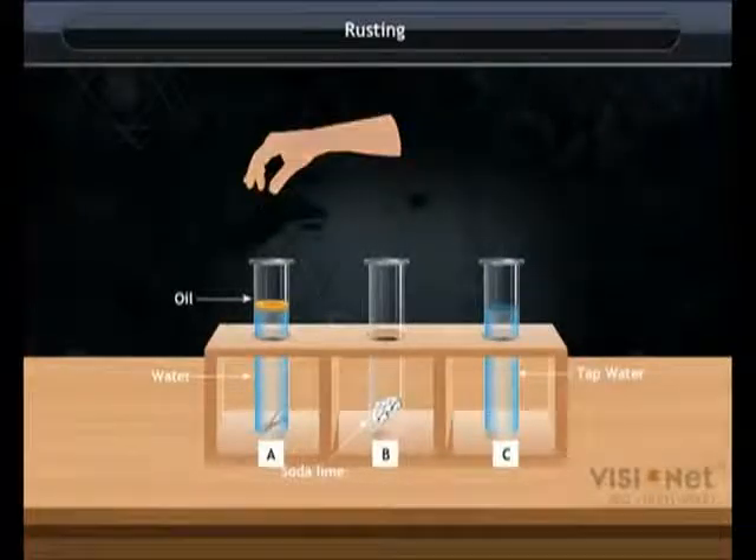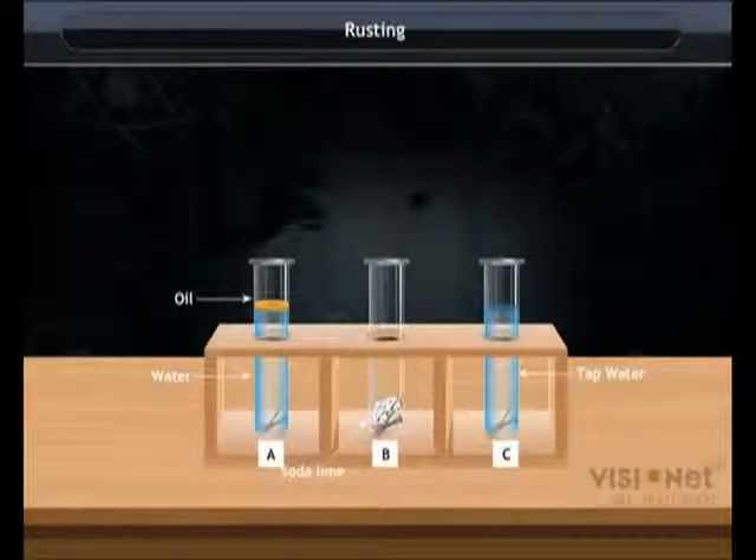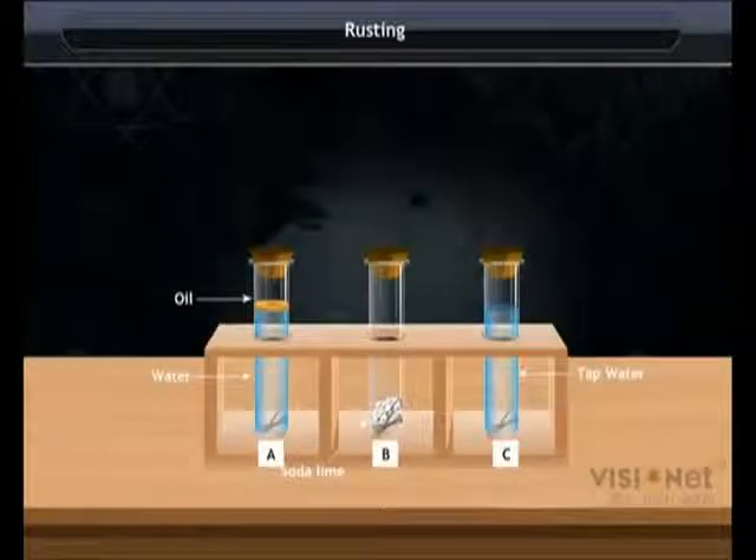Then take three iron nails and place them in the three test tubes. Cover the mouth of the test tubes with cork and wait for a few days, then observe what has happened.